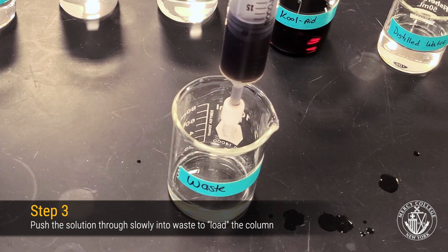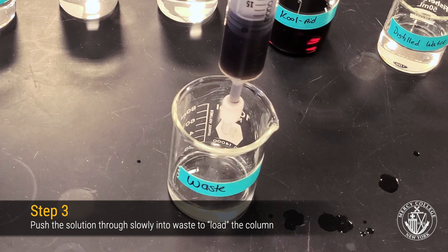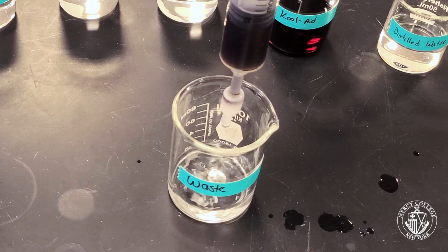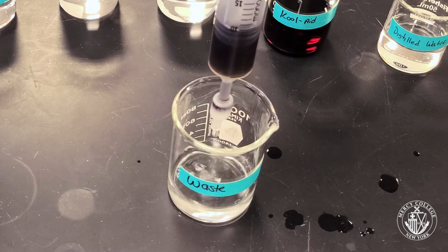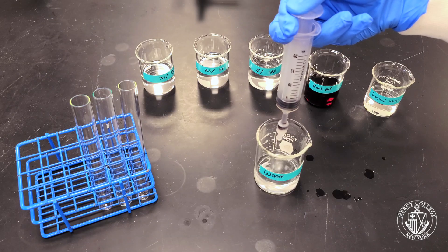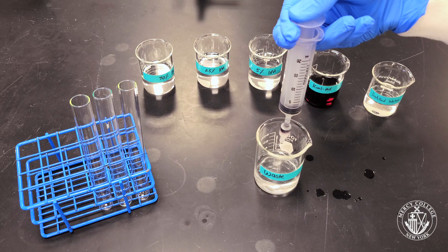This puts our Kool-Aid mixture on the column so that we can extract the individual colors using different concentrations of isopropyl alcohol in the next step. The liquid should come through clear. All of the grape coloring should be left behind on the column.